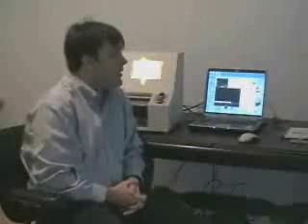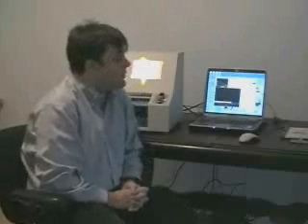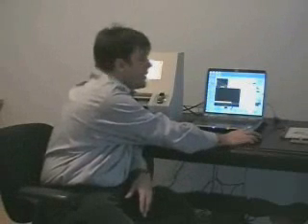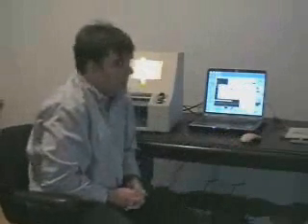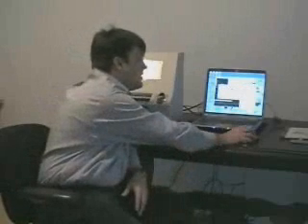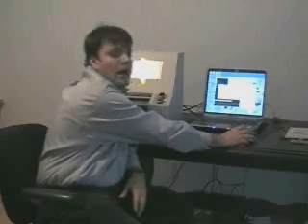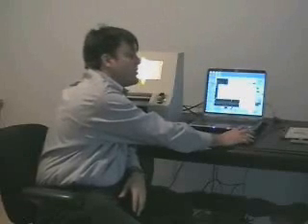Now, the first thing that you'll want to do is test to see whether or not your controls, your software, is controlling the machine. I can hit the start button on the software, and if nothing happens after hitting that start button, a window will pop up saying backlight adjustment. Simply click on the little box on the left that says light adjust.